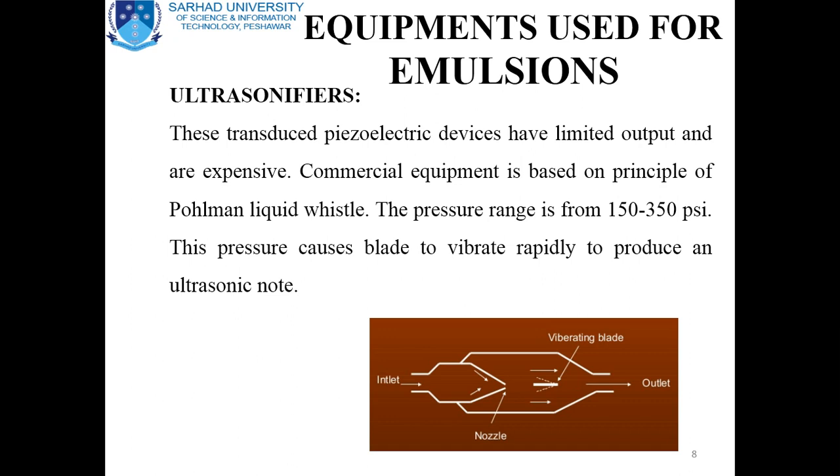Remember that ultrasonifiers are also used for the formulation of suspensions.